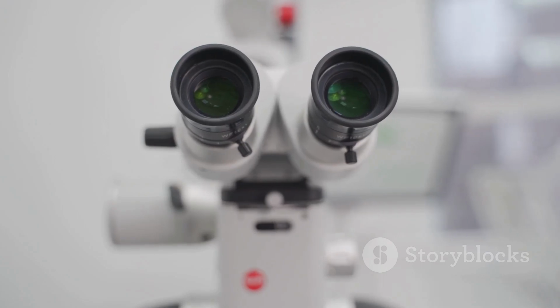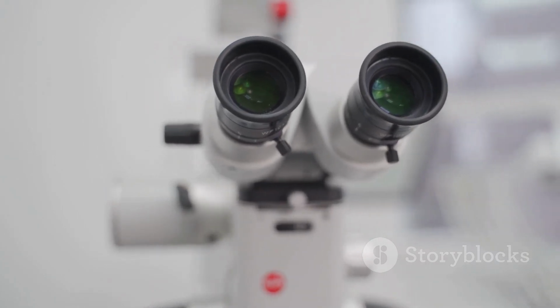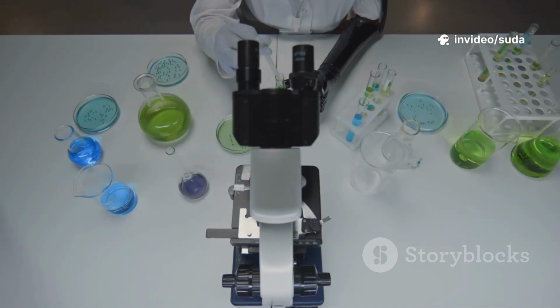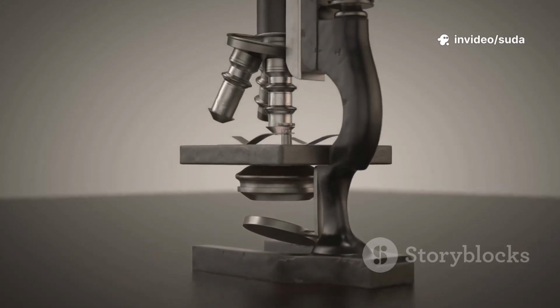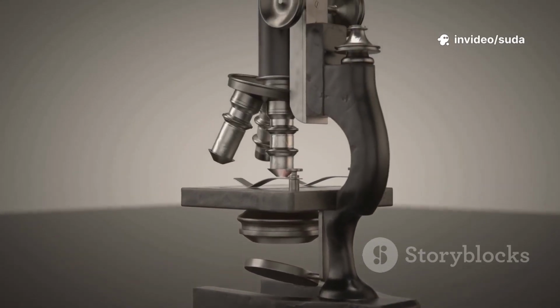Switch to 10x. Refine with the fine knob. Adjust the diaphragm. Sometimes less light shows more detail. Finish by returning to low power, removing the slide, and putting the microscope away.